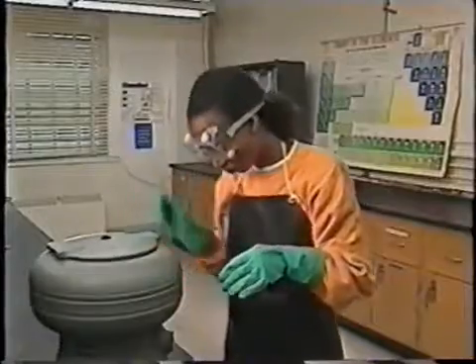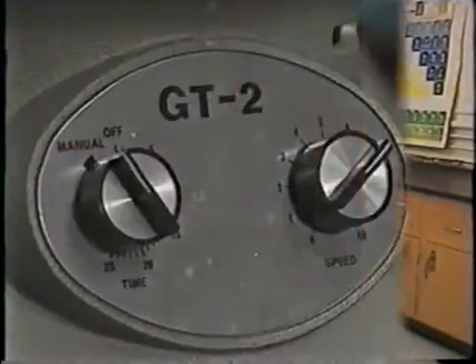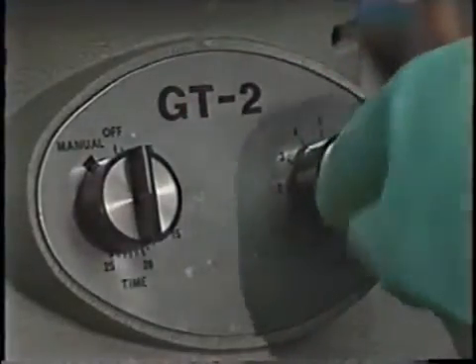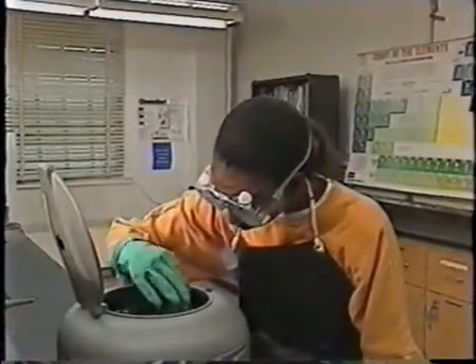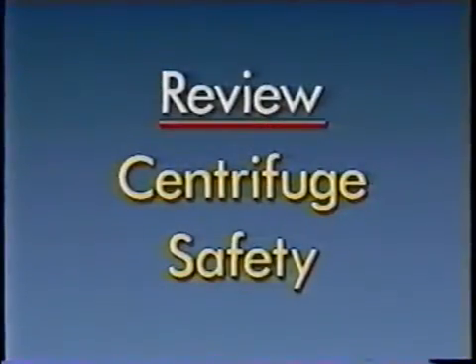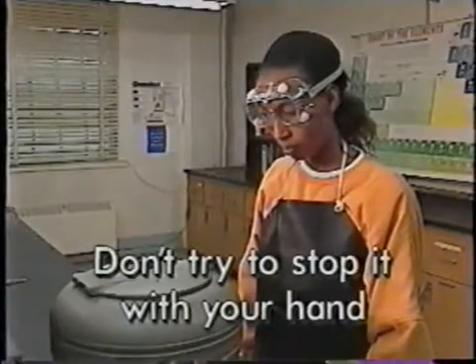Once the centrifuge is balanced, you can turn it on. When it's finished, turn it off and wait until it stops spinning on its own — never try to stop a centrifuge with your hand. Place equally filled test tubes in a centrifuge to balance it, and don't try to stop the spinning with your hand.